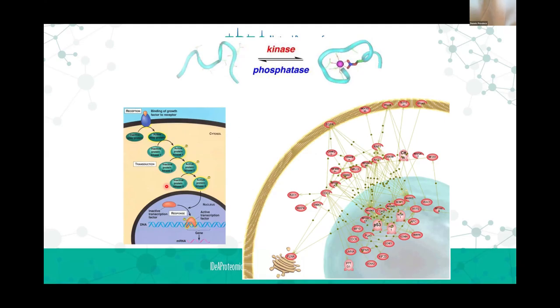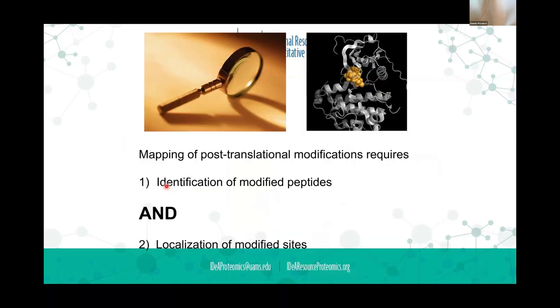The reason is it's one of the things that in mass spectrometry you can measure that's difficult to do with another type of technique. The kinases and phosphatases are working in conjunction with one another into some response, and so it adds complexity to the proteome, and something that you can hold over the head of your colleagues who do genomic analysis. You can't really do anything with phosphorylation there. So mass spectrometry and proteomics at least allows a way that you can target this.